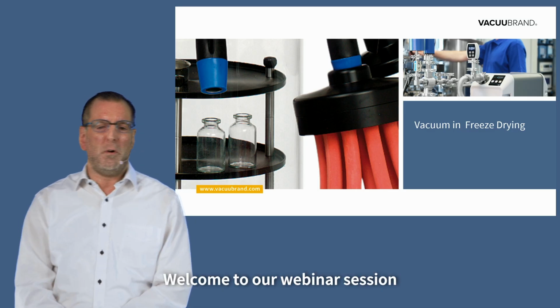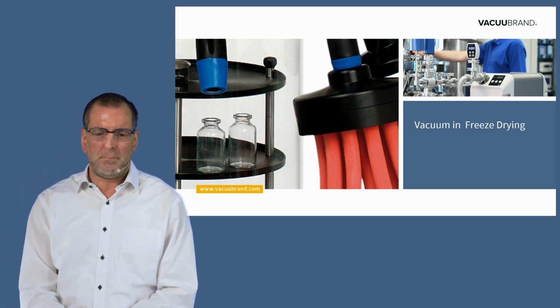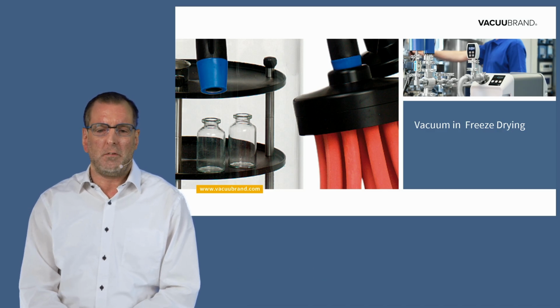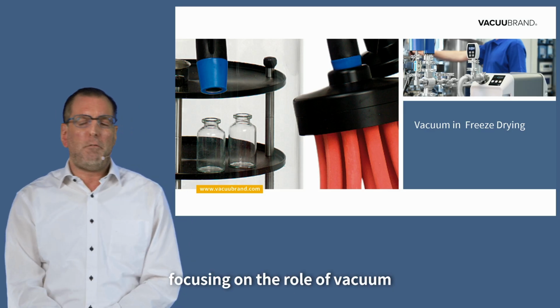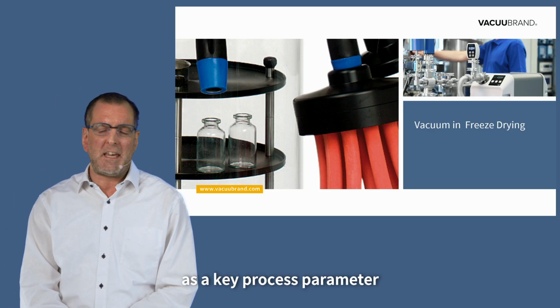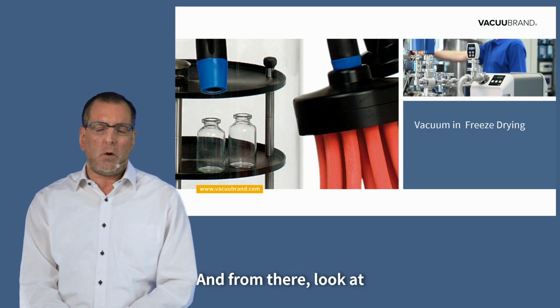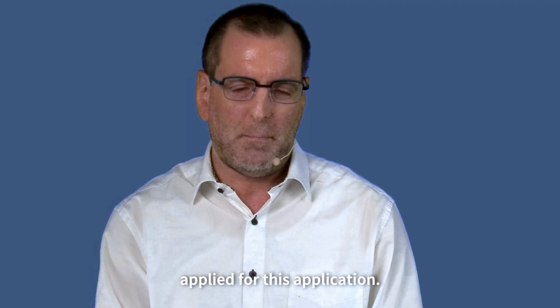Welcome to our webinar session titled Vacuum in Freeze Drying. In this session today, we will look at the background of the freeze drying process itself, focusing on the role of vacuum as a key process parameter in this gentle drying method. And from there, look at corresponding vacuum technologies applied for this application.